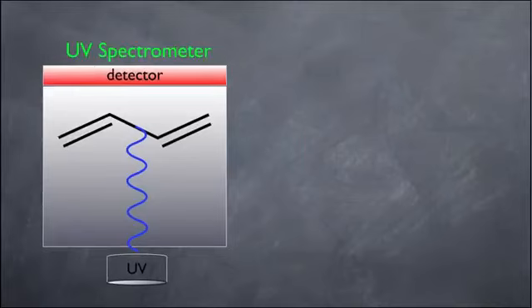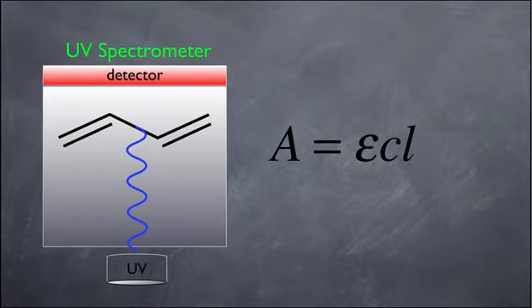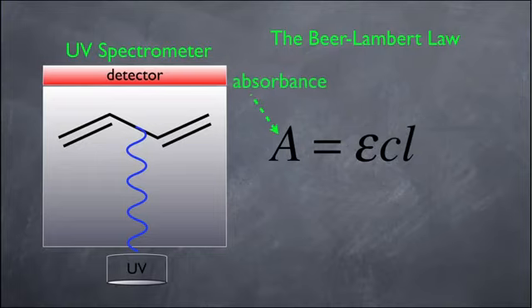One other aspect that we should know is that there's an equation that relates to the UV spectrometer, and it's called, I'm not kidding, seriously, the Beer-Lambert law, okay? Basically, what this equation calculates is you plug in the absorbance. Remember, that's off the chart. On the y-axis of our spectrum is absorbance. You can plug in absorbance right there.